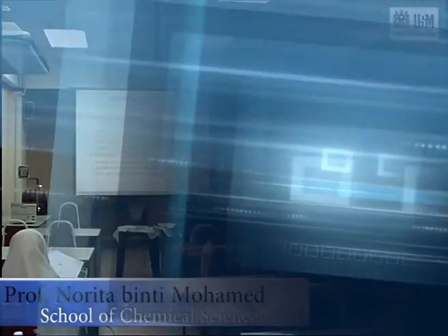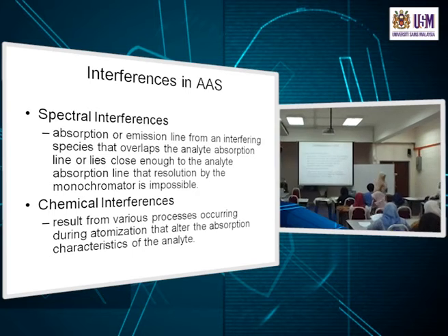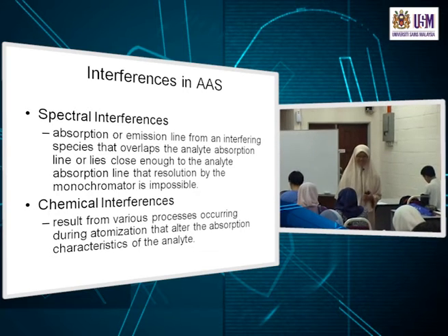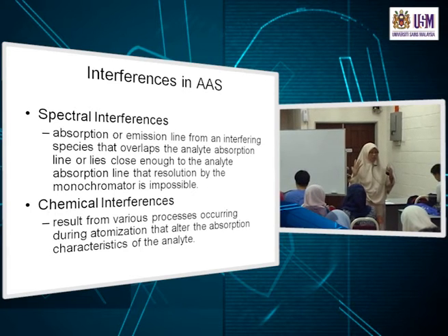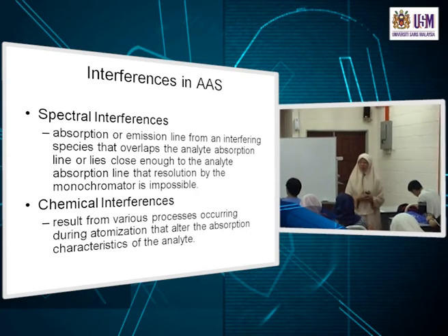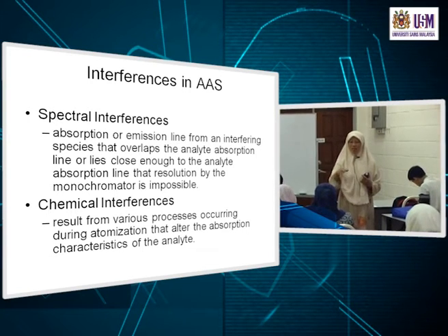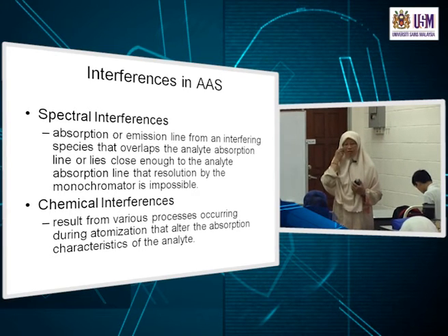Word interferences. What do you understand by that? Interferences, yeah. In the AAS technique, we say interferences. What do you understand by interferences? What are we measuring? Okay, what are we measuring in AAS? Absorbance of the analyte.